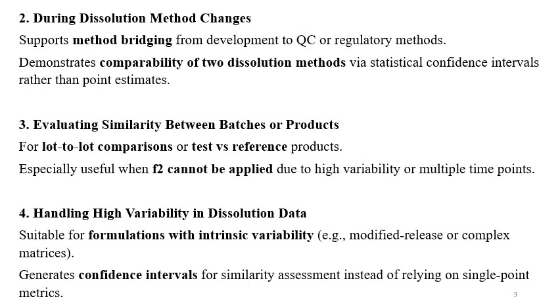Evaluating similarity between batches or products. For lot-to-lot comparisons or test versus reference product, especially useful when F2 cannot be applied because of the high variation, high variability, or multiple time points.